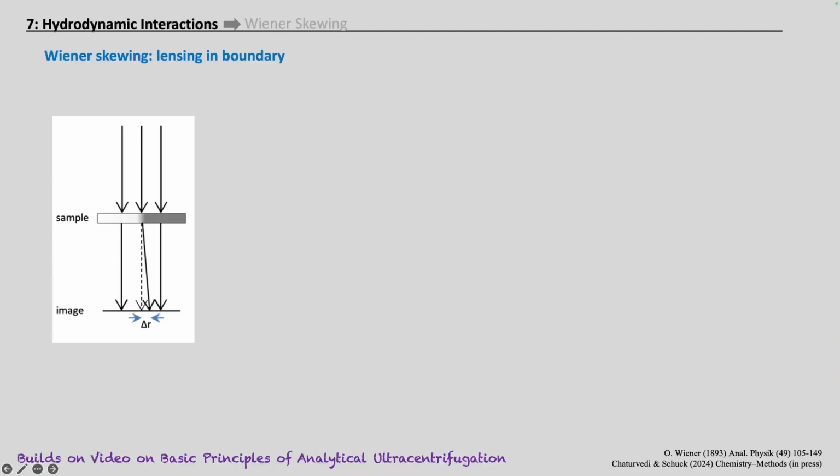But really, this example at 50 mg per mL of BSA is a little bit pushing the limit of concentration where the non-ideal c(S) model is really applicable. One problem is the optical detection in the analytical ultracentrifuge. When we create sedimentation boundaries with amplitudes of tens of mg per mL of protein, they will be associated with a significant refractive index gradient.